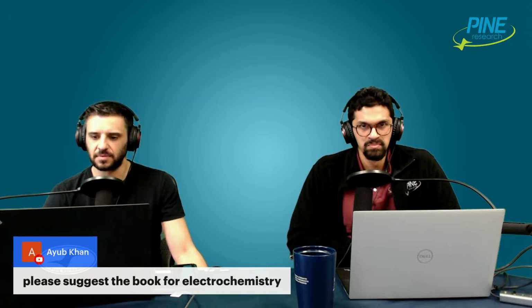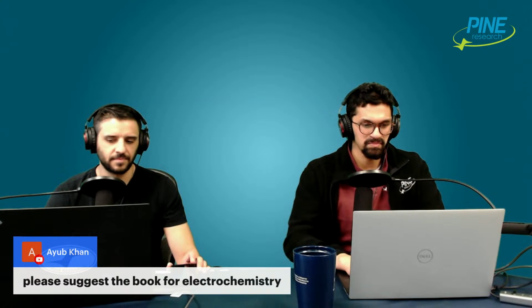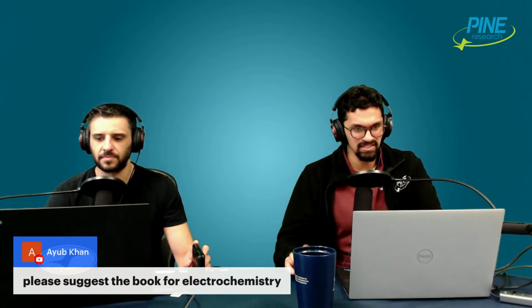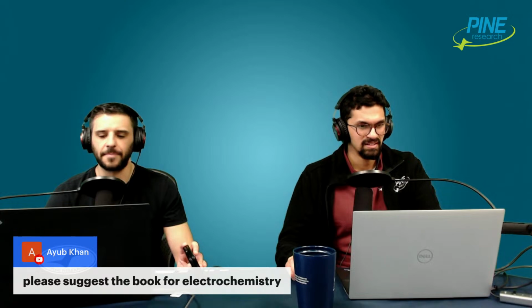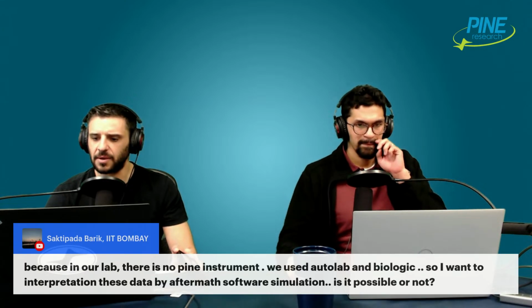If you just type in Bard electrochemistry, you'll probably find the book. Let's actually see if I'm right. Bard electrochemistry. Yeah, the second edition of the book comes up first, and there's a third edition that's out. So you'll be able to find it. Electrochemical Methods. This last question, Saktipada, I think you're at IIT Bombay.